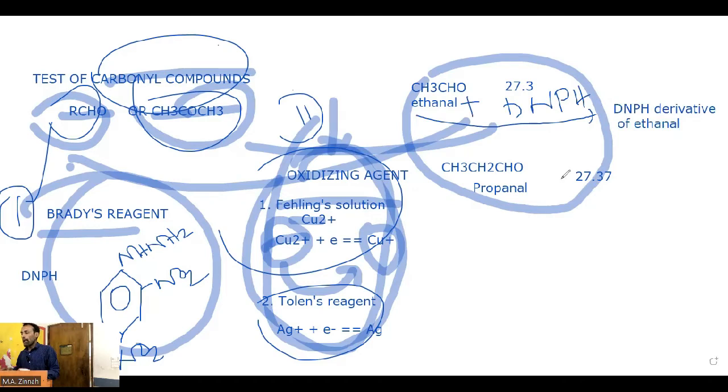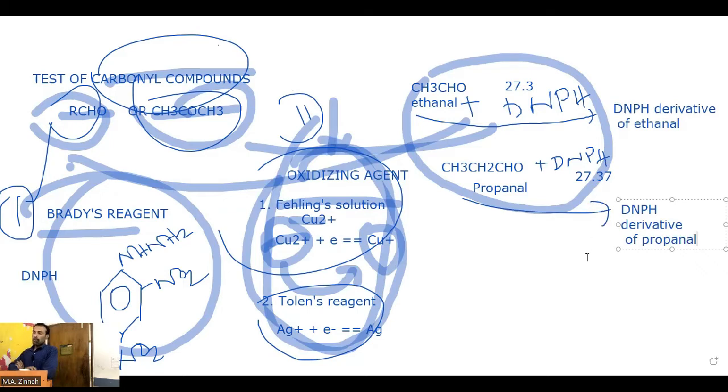And they also have added this to the DNP, and this also results in DNP derivatives of propanal. Okay, propanal.